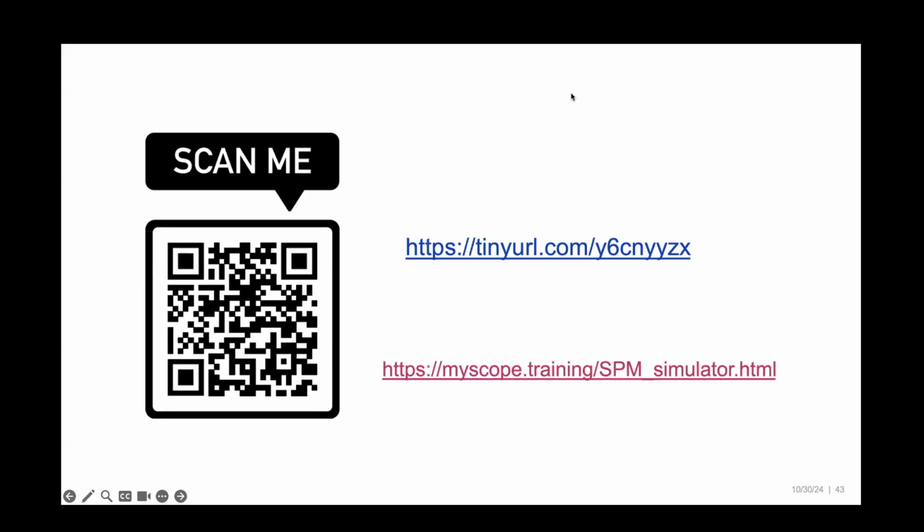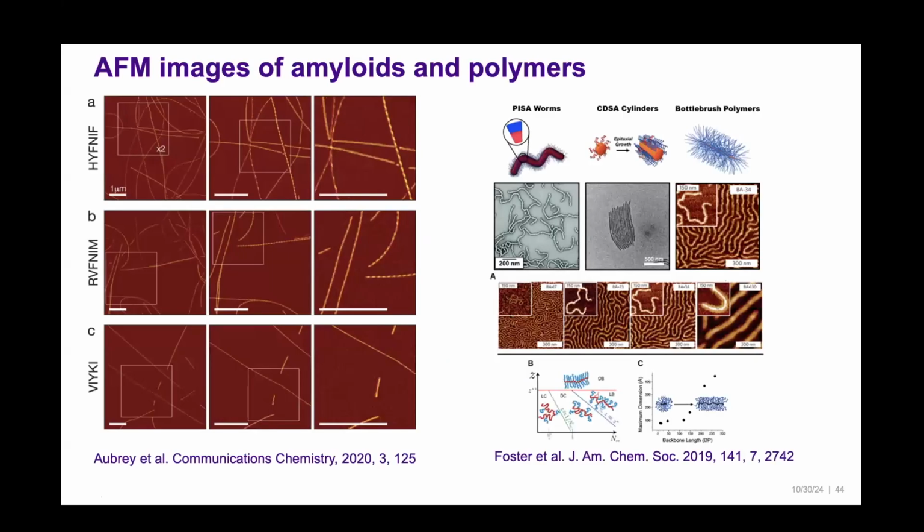Related to the tip diameter, we can also measure spectroscopy there, which is called force spectroscopy. We will not go into details. Here are some examples of how beautiful the structures are that you can see from AFM. These are protein self-assembled structures or peptides called amyloids, which have relevance in some neurodegenerative diseases. What you see here is the helical pattern of a few nanometers of these self-assembled fibers, and how nicely you can see the helical pattern, and calculate very precisely the pitch length, the distance between two helices.